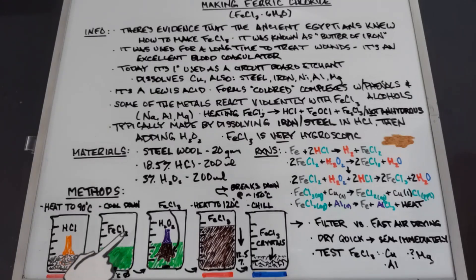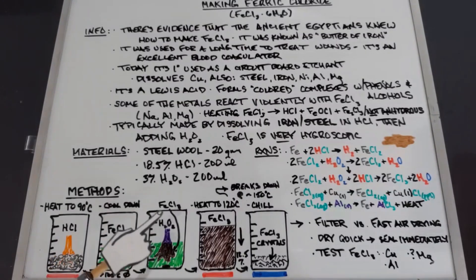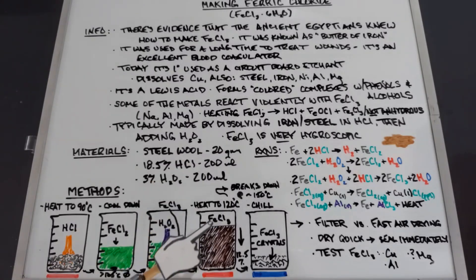When we add the hydrogen peroxide — kept below about 100°C so it doesn't break down — we'll get an immediate color change from green ferrous chloride to brown ferric chloride. Once we've added all of the hydrogen peroxide, we'll have about 400 milliliters total. At this point you could use it as a copper etchant, but I'm interested in getting a concentrated solution and some crystals.